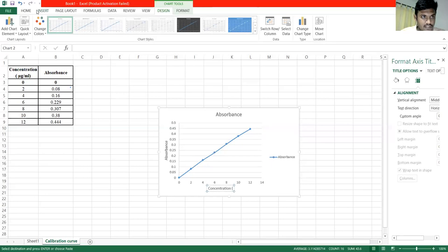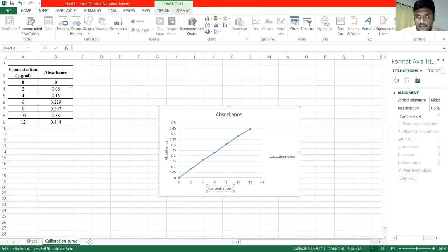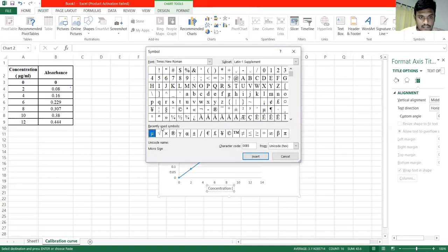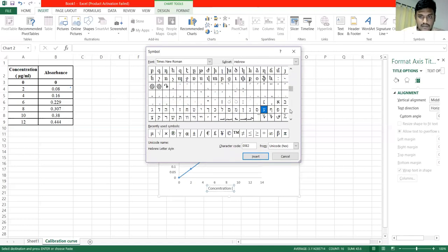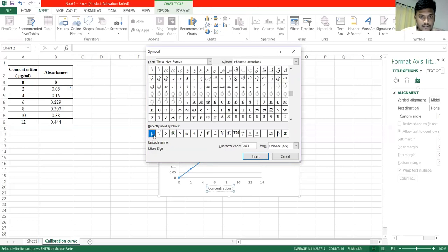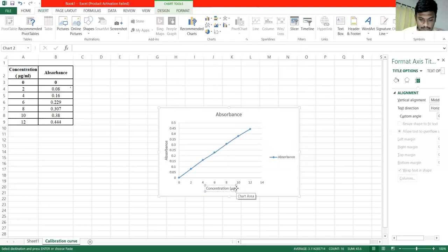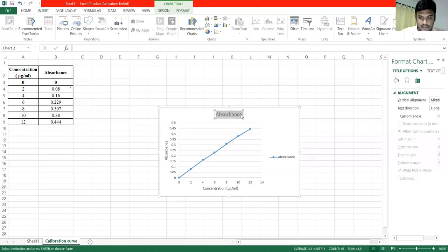In the microgram parameter, click on the last symbol and click on the symbol to insert it. Select the microgram parameter and click on the icon to apply it.